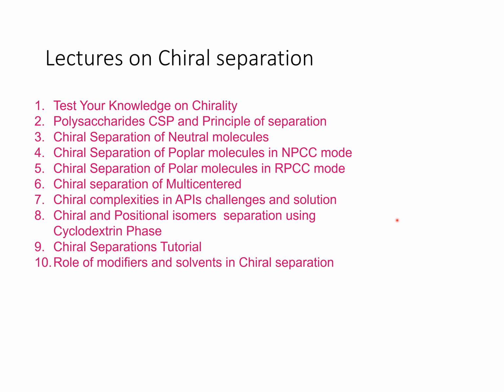This is all about chiral separation of neutral molecules.